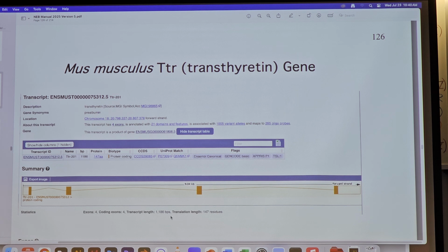You will recall, because we've talked about it a lot, that for our RT-PCR experiment, the forward primer was in the middle of exon 1, and the reverse primer was in the middle of exon 2. And if we amplified a product from RNA, then we would get a 150 base pair product because it would include part of exon 2 and part of exon 1, right? Everybody remember that? Yeah.